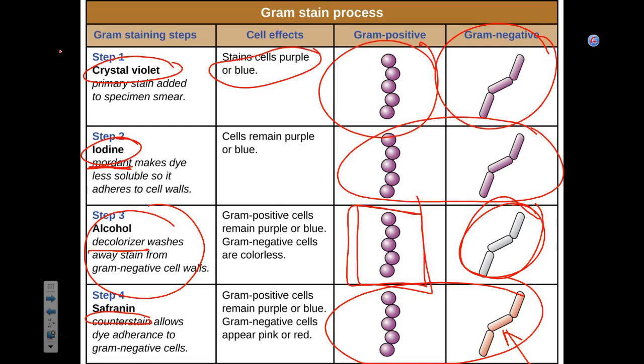Okay? Any questions? I want you to know the steps and the function of each chemical. So what is the function for alcohol? It's decolorizing. Clear? Good?